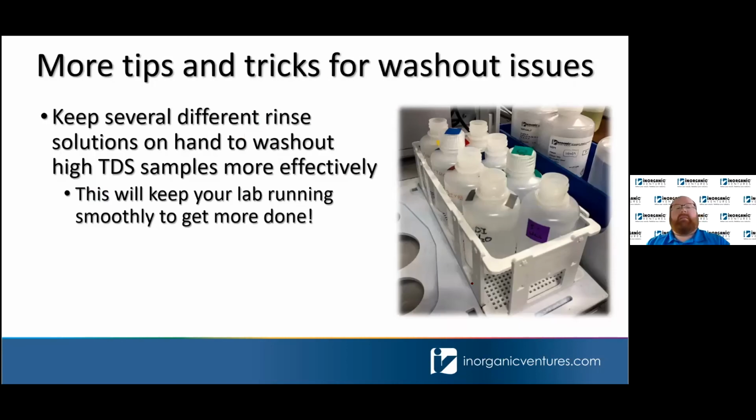Lastly, some other tips and tricks for washout. Keep several different rinse solutions on hand so that you can handle your high TDS samples more effectively. By doing this, you're going to keep your lab running smoothly to get more done.